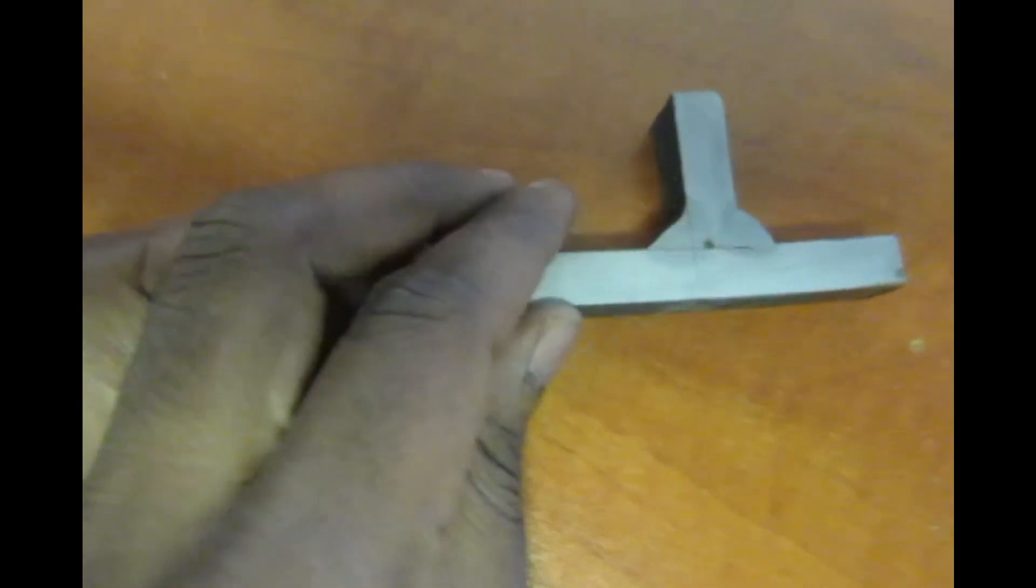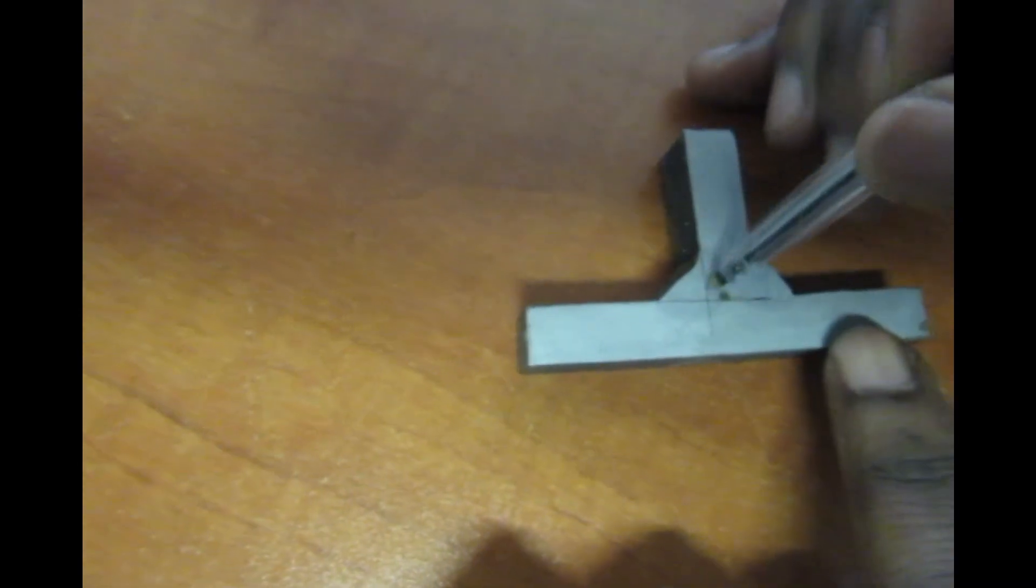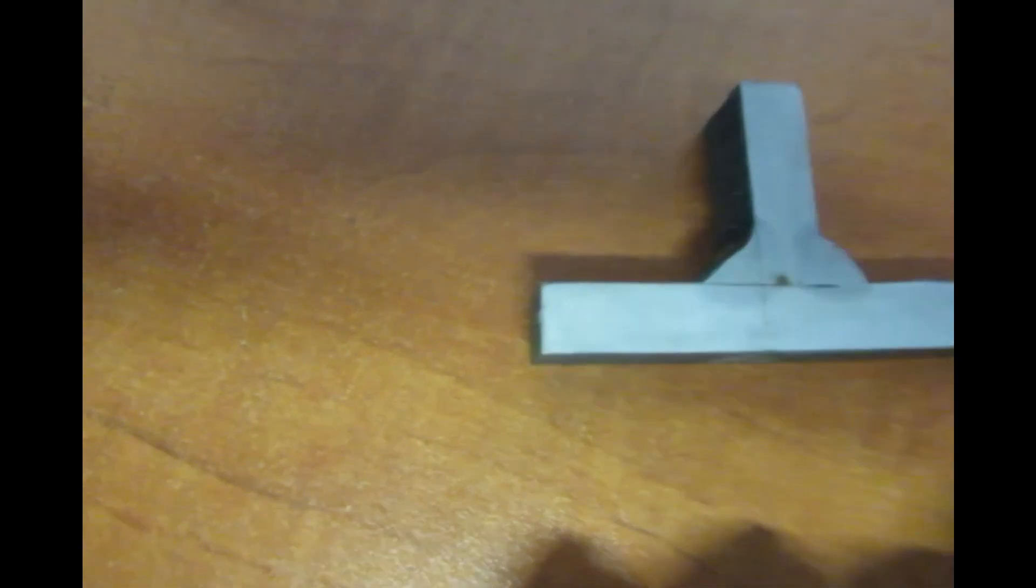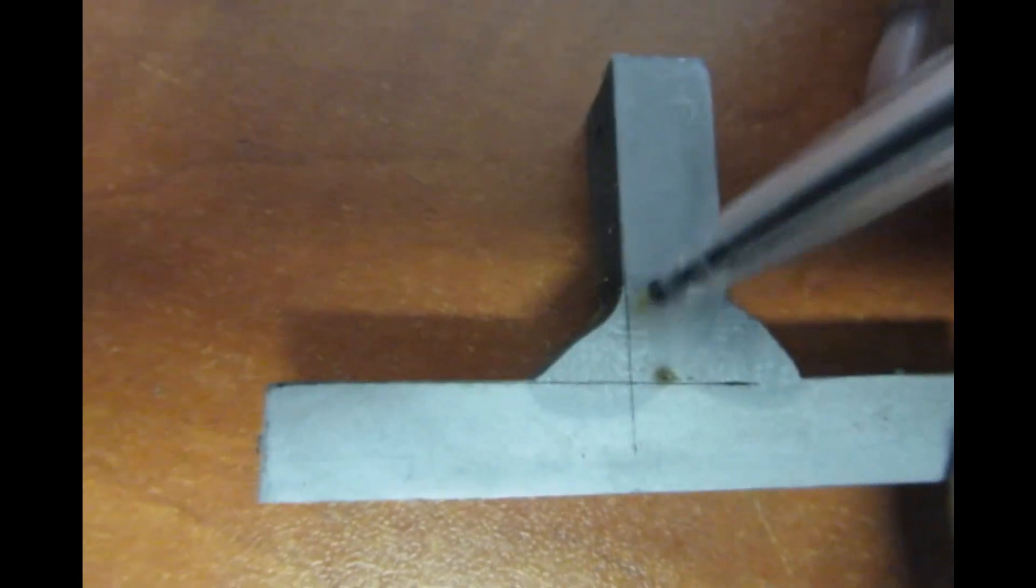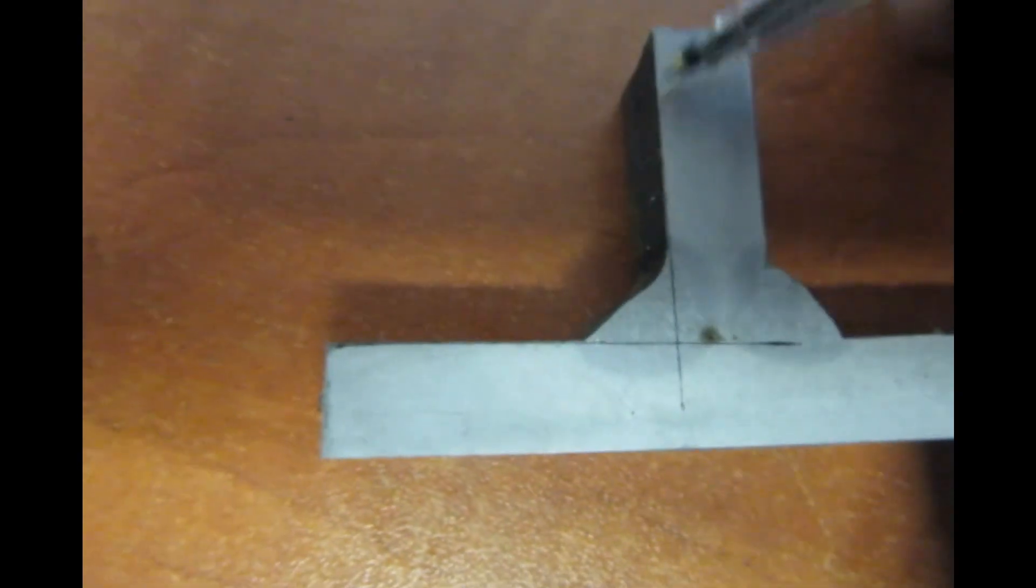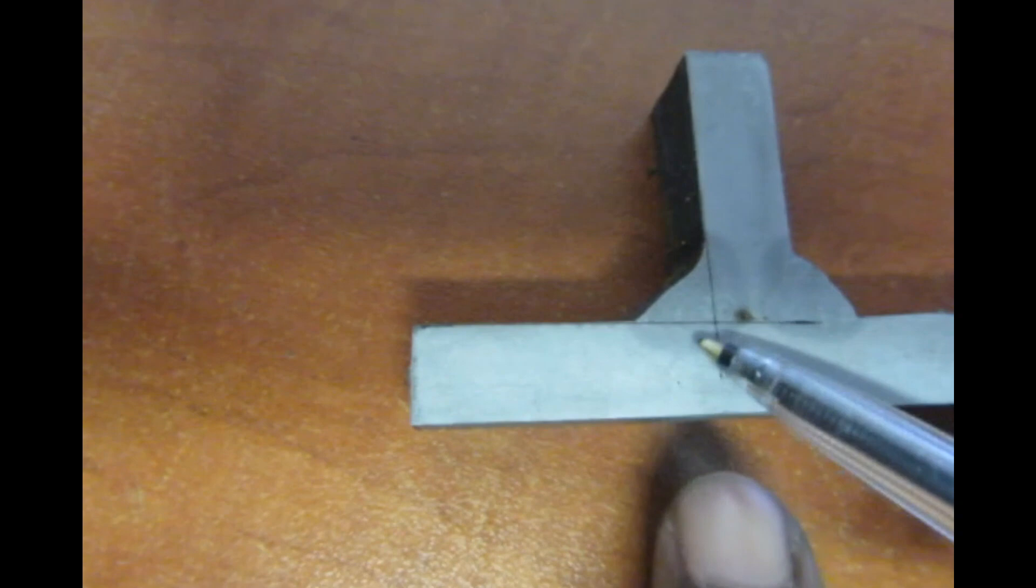I want to evaluate a fillet weld. Everything behind my vertical line and behind my horizontal line does not count. For me to testify that this is well welded with enough fusion, I need to see the weld traversing, crossing the continuous line of my parent metal for both the vertical and horizontal plates. I can see the weld is there, so I can testify there is enough fusion on both sides.